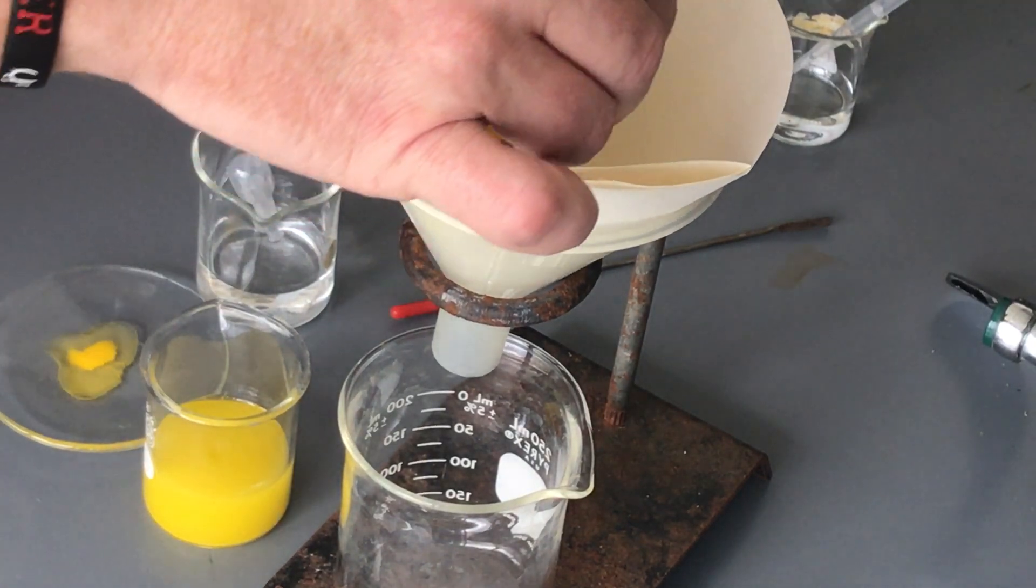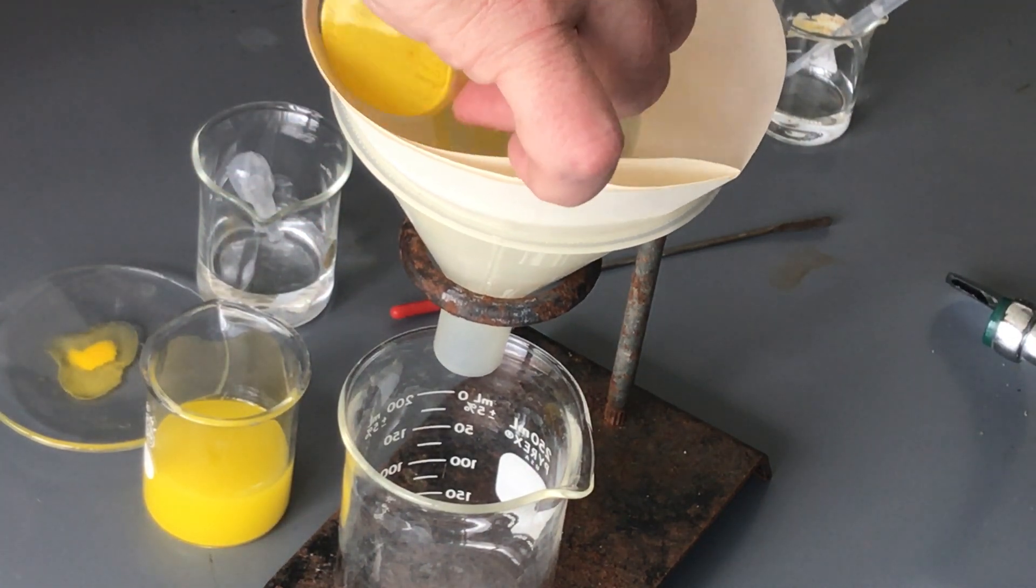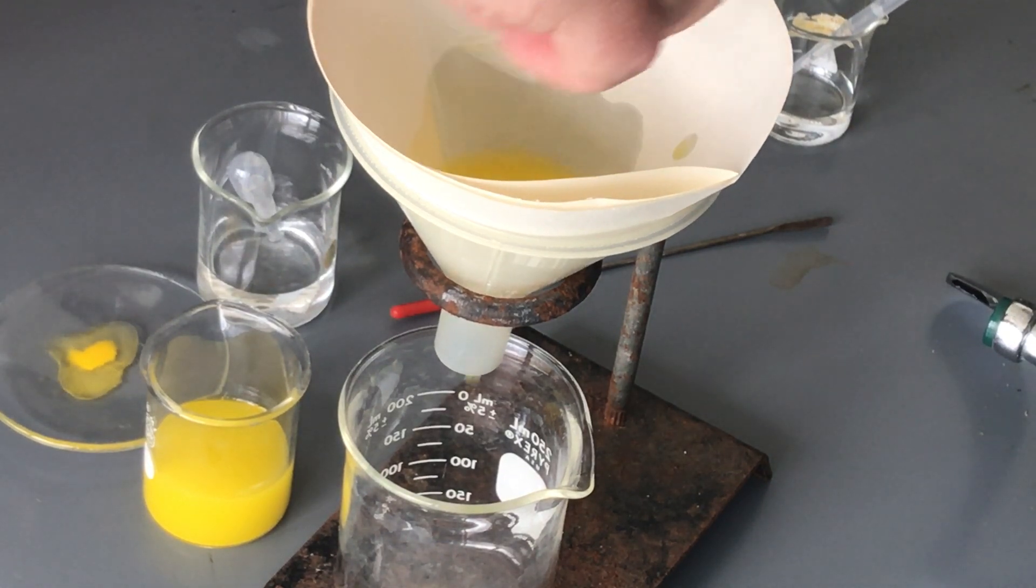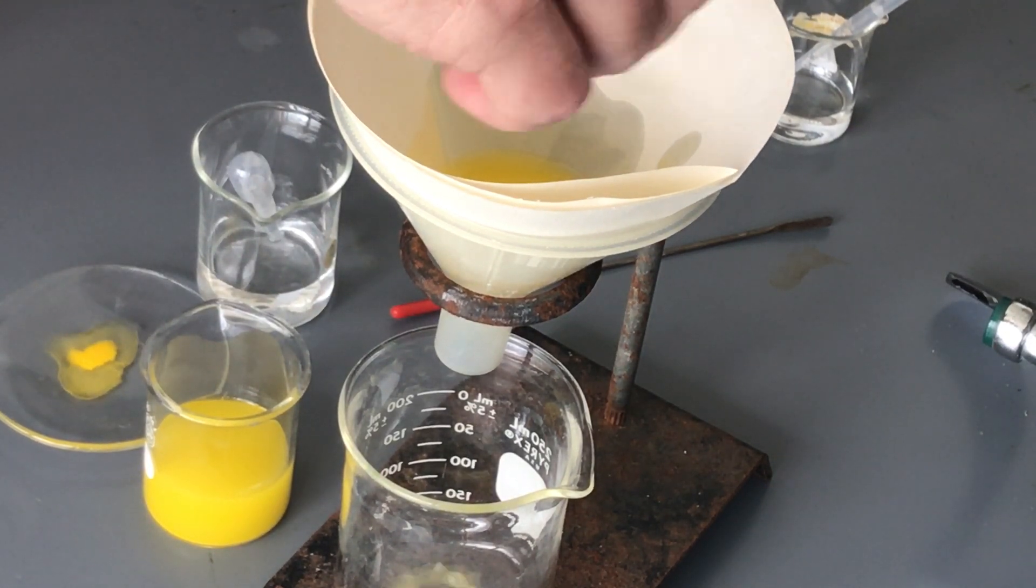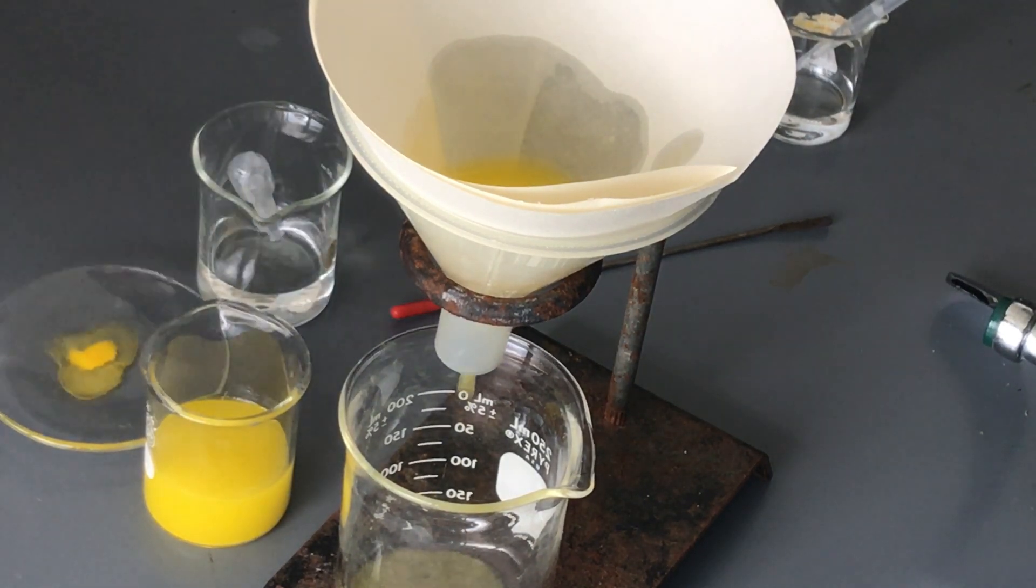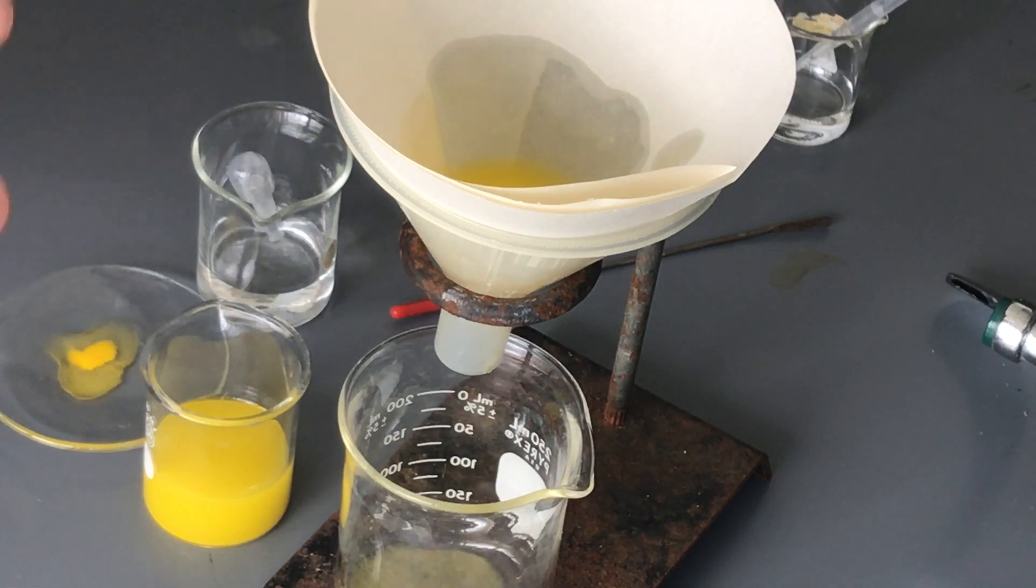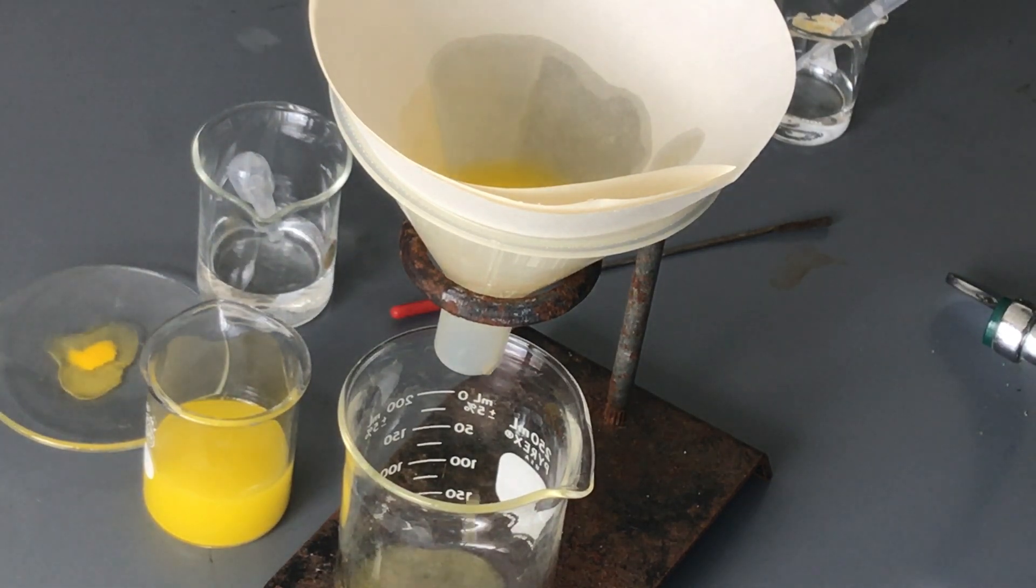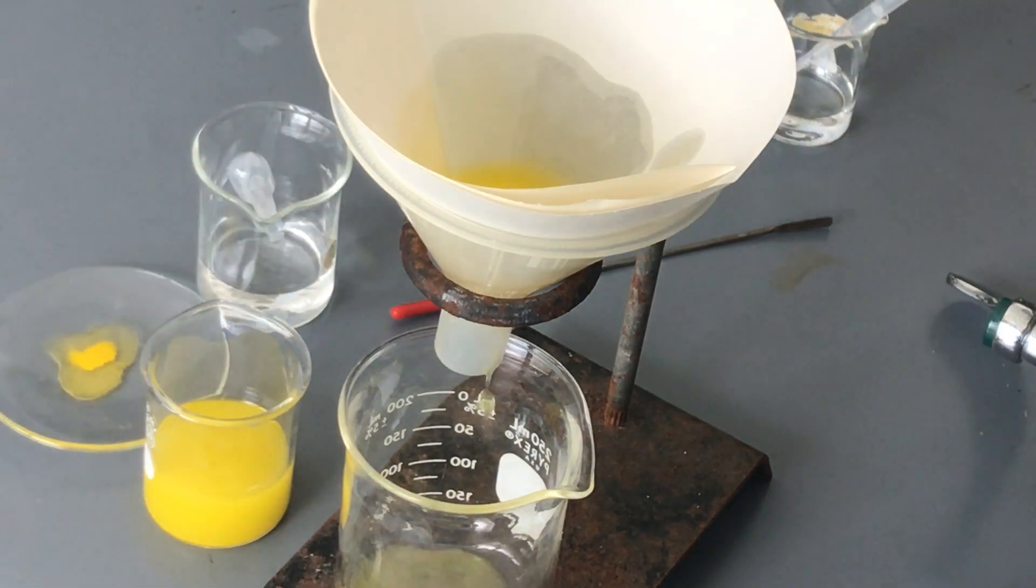We can just basically start to pour it into our filter paper and our filter paper should be able to take most of it out. Now depending on the severity and how well the filter paper is made there may be some holes. So I'm already looking and seeing that I'm getting a lot of yellow at the bottom and so this might not be the best filter paper to use. So I might have to do a double run or use a thicker material.